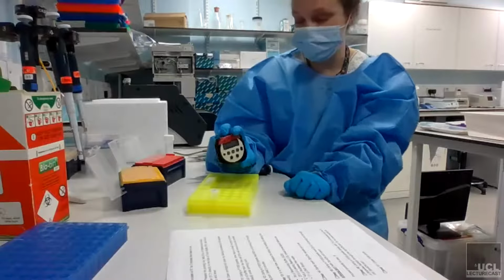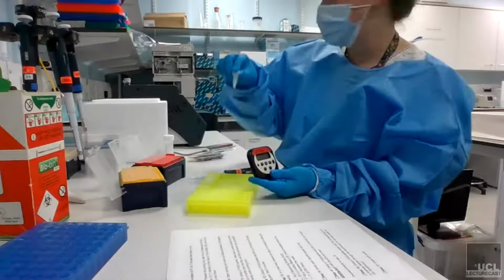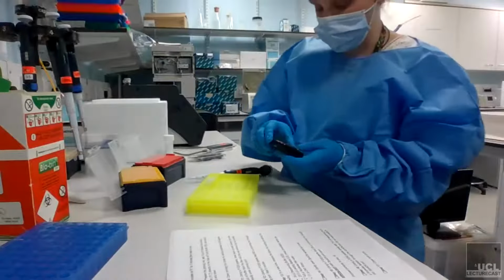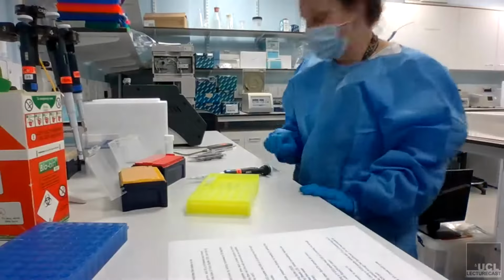But I'm not going to sit here for 5 minutes because that would be quite boring. So after the 5 minutes at room temperature, you can then just put it on ice whilst you're preparing the rest of your protocol.